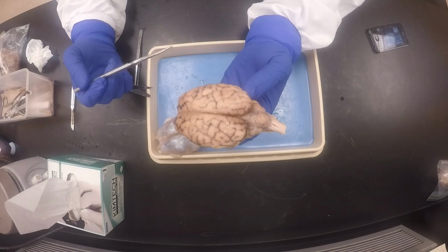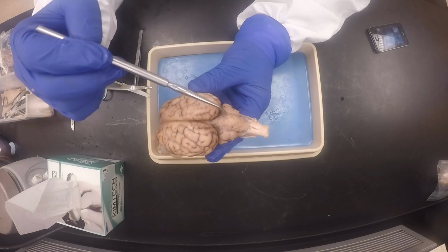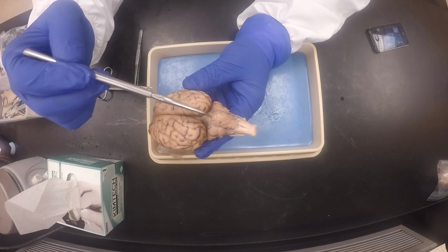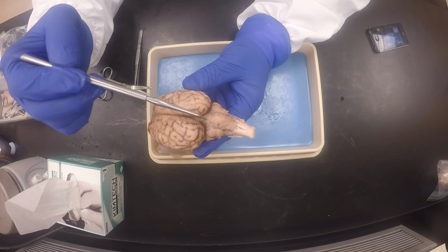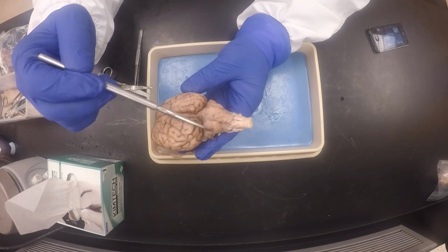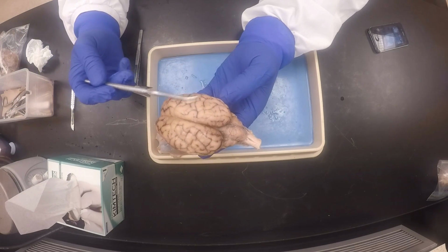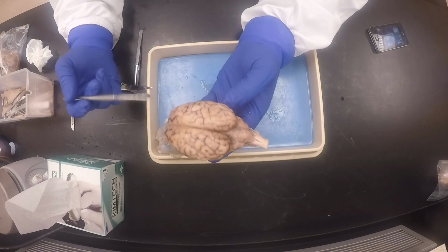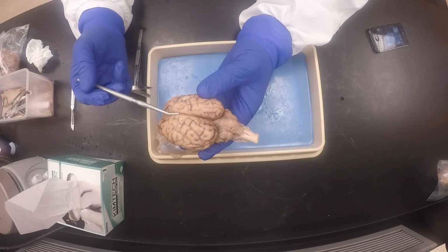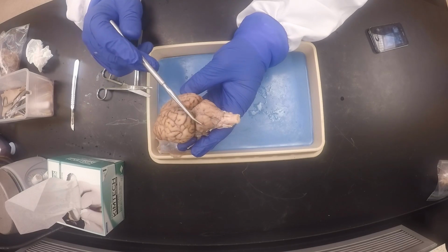Okay, and then we go to the cerebellum, which is literally the little brain. This part here is the vermis. You see, this looks like a worm. It connects one cerebellar hemisphere to the other cerebellar hemisphere. And of course this is the cerebral hemisphere, and there's the other cerebral hemisphere. When we cut through, we'll be able to see the corpus callosum, but we can't see it now. The vermis is the part that connects the cerebellar hemispheres.